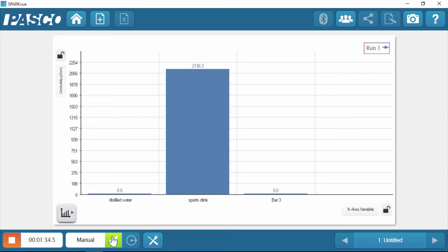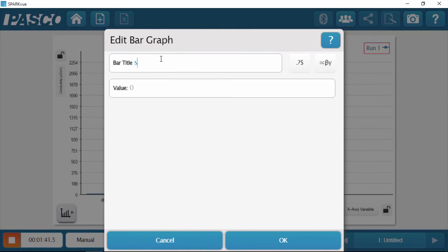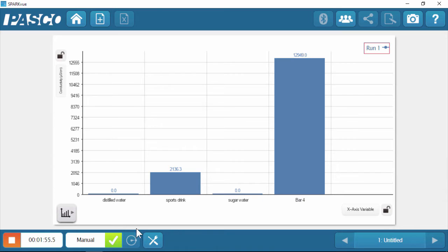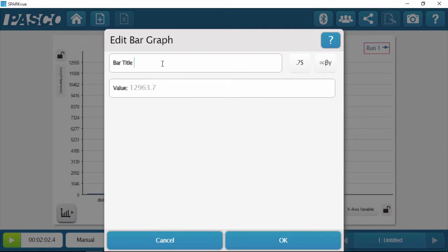There's a little fluctuation, but it went back down right around zero — pretty similar to distilled water. I'm going to hit keep and rename that bar. Now let's try the salt water. Wow, that's over 12,000 — a huge jump. The sensor can read up to 20,000 microsiemens per centimeter for conductivity. If you have a sample reading higher than 20,000, you might want to dilute your sample to get a more accurate representation of what's going on.